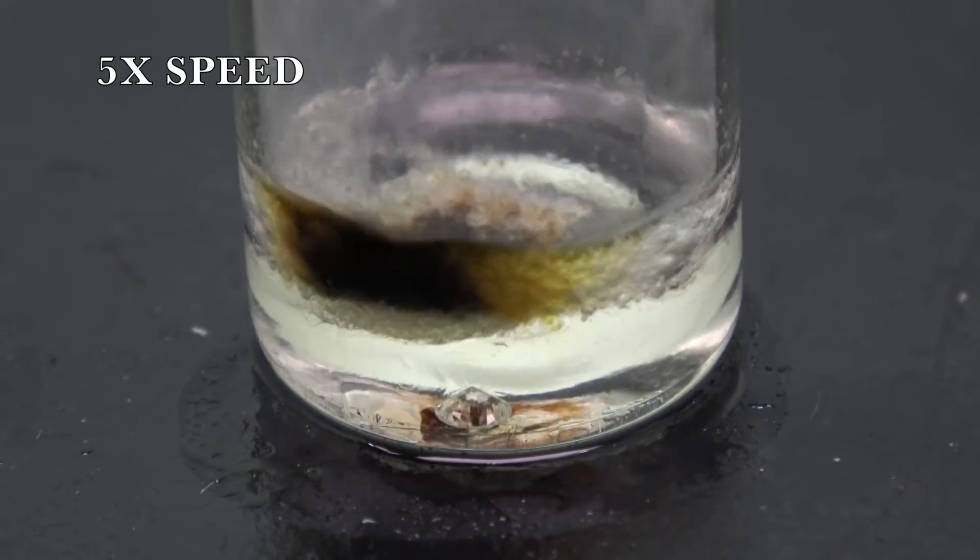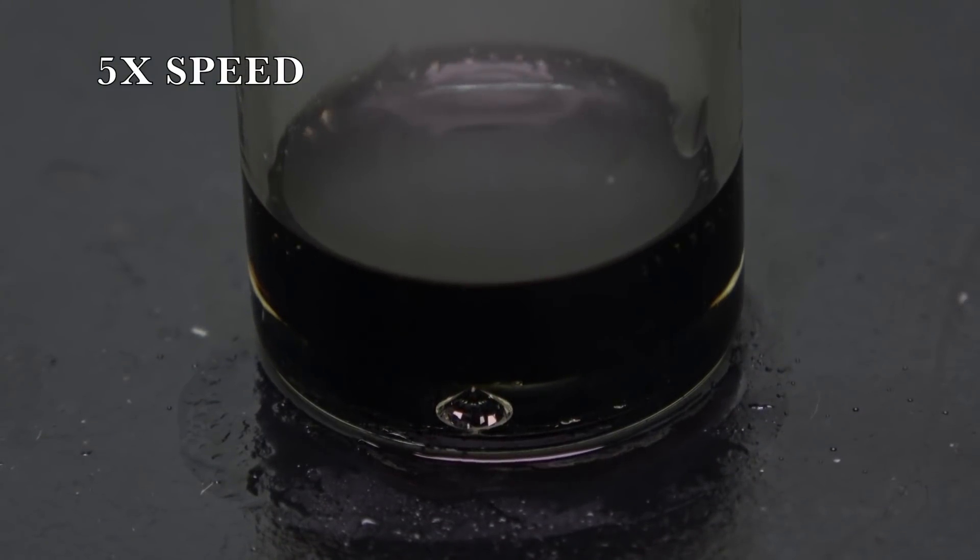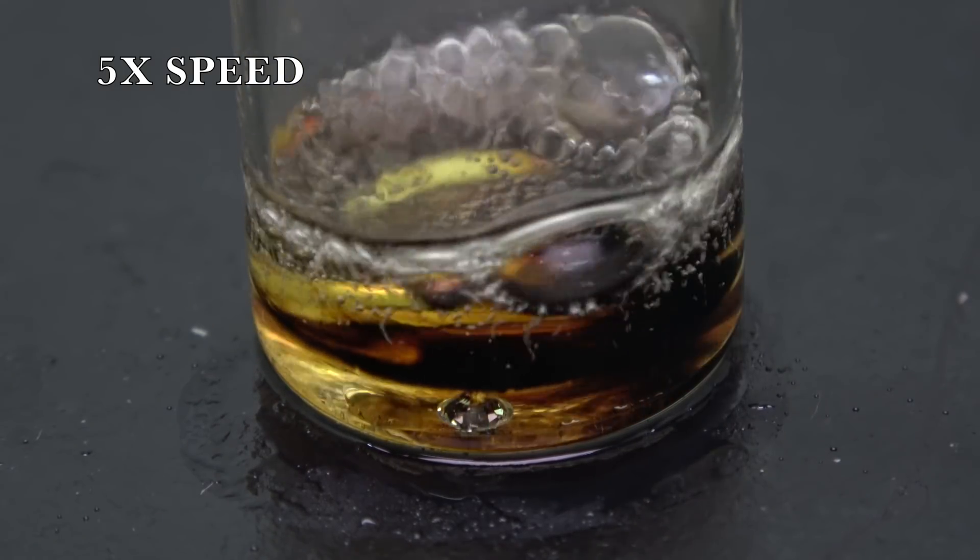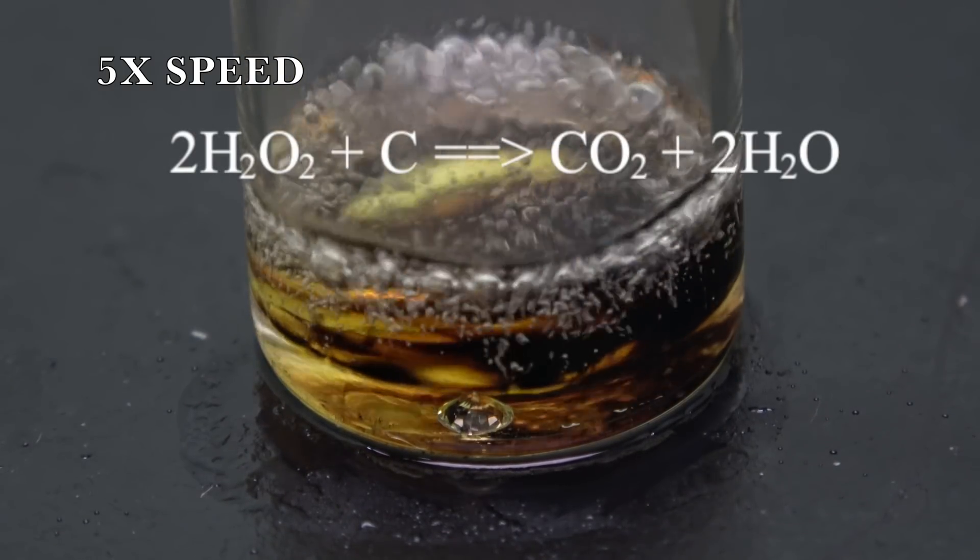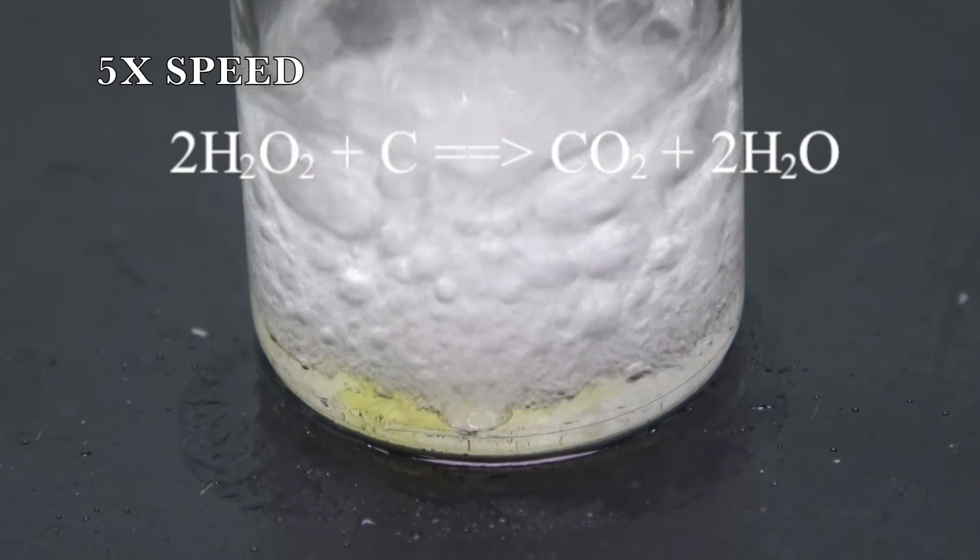To speed things up, I added a few drops of 30% hydrogen peroxide. Essentially, I was making a famous mixture known as Piranha solution. Hydrogen peroxide grants the mixture an insane oxidation power. It oxidizes the carbon to carbon dioxide.